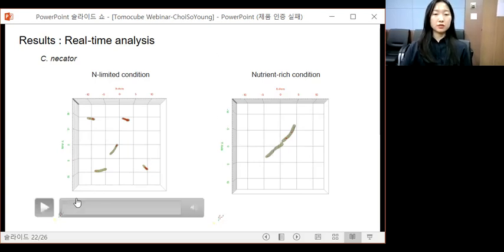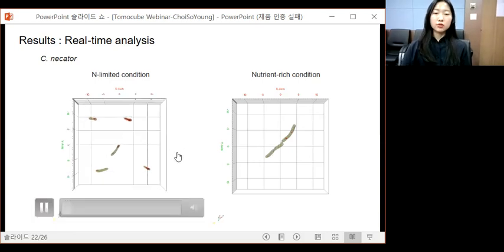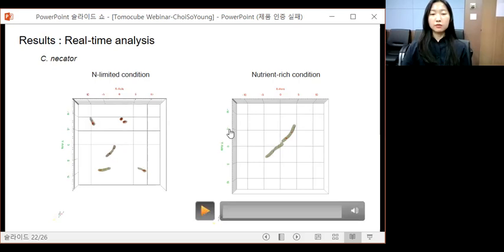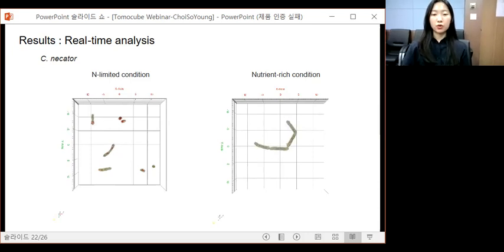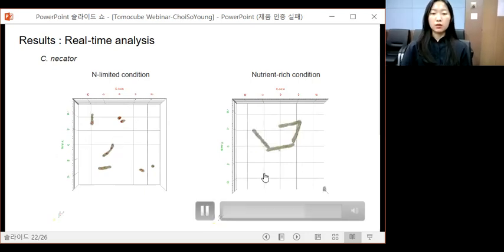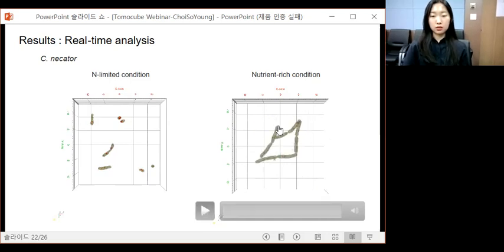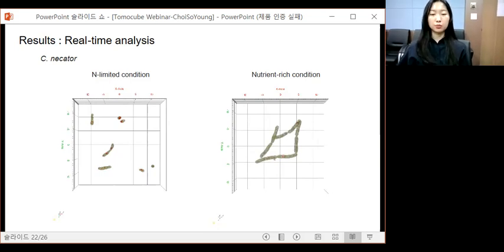Now let's see the movies. The PHA granule cells were generally localized throughout the cell cytoplasm, and the daughter cell generated by cell division could divide up the PHA granule. In the right movie, given that this condition is more suitable for cell growth, the cell shows more active cell division with larger cell than the left cell. However, similar to the left, the PHA granule were localized throughout the cell cytoplasm, and the daughter cell generated by cell division contain a similar amount of PHA granule.